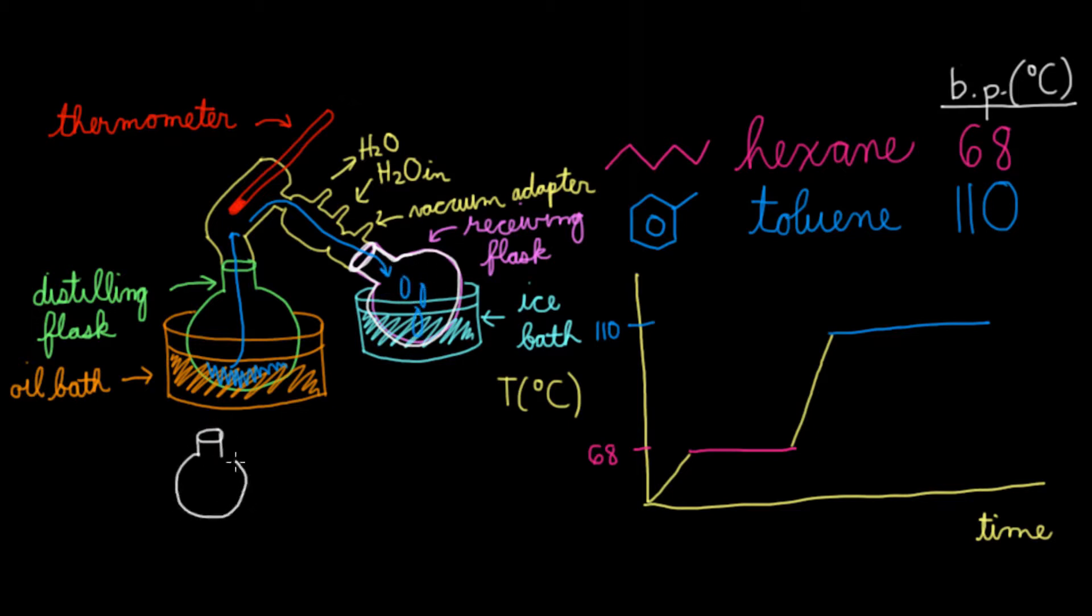So, ultimately what we've collected are these two flasks, one with toluene and one with hexane. And there we were able to do a pretty successful distillation.